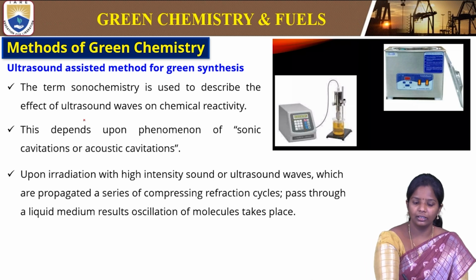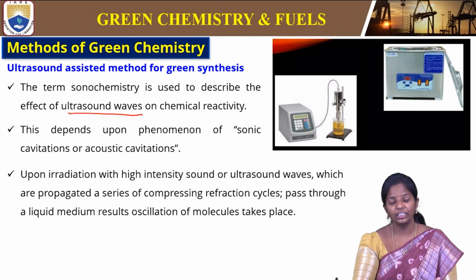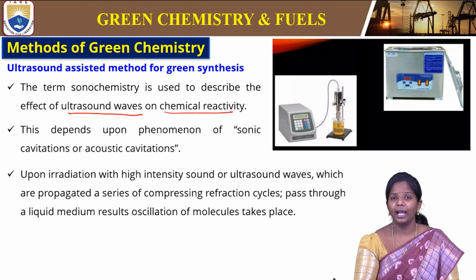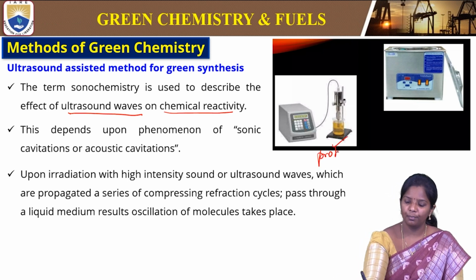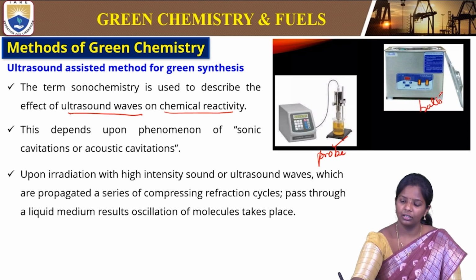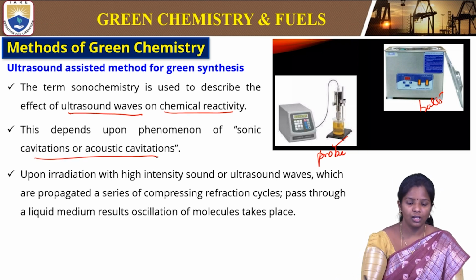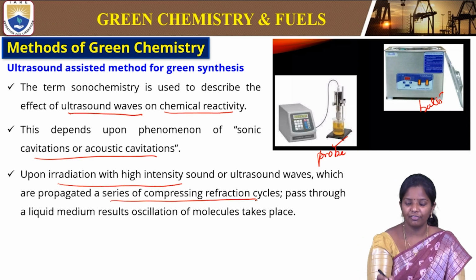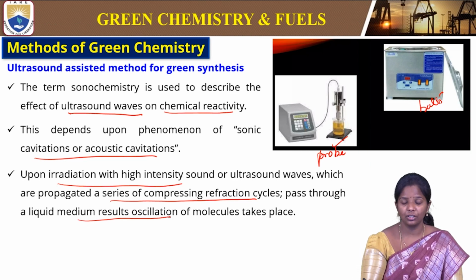Ultrasound waves will help in changing the reactants into products because of their chemical reactivity. That will make the reactants work together to produce products. So this is the probe method, and this is the bath. These are the two we are using. It all depends on the cavitation that is produced. Upon irradiation with high-intensity ultrasound waves which are propagated, a series of compression and rarefaction cycles takes place as they pass through the liquid medium, causing oscillation of molecules.